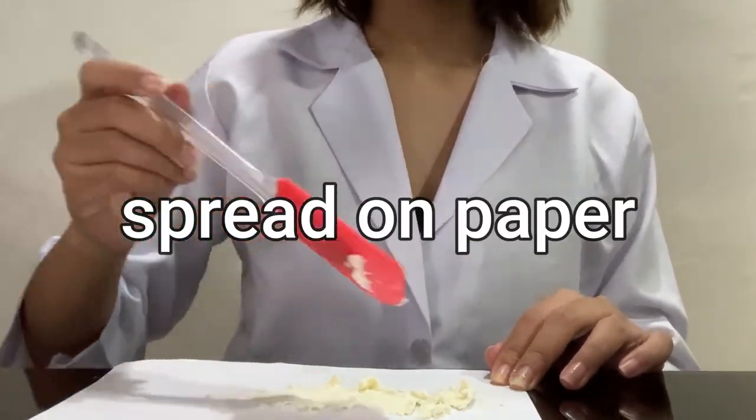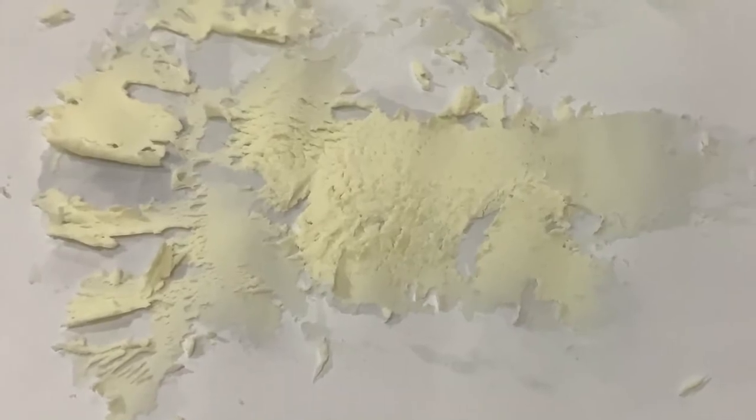And then we're done. It should look like this after it dries.